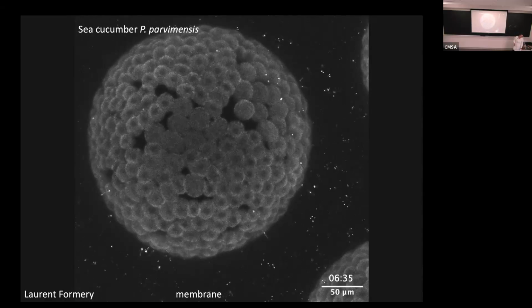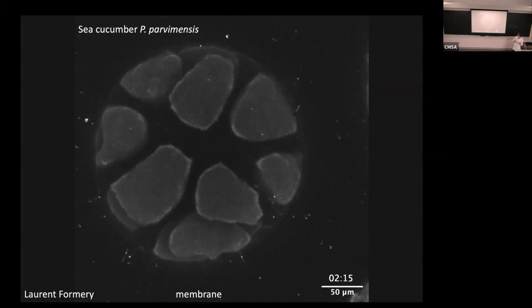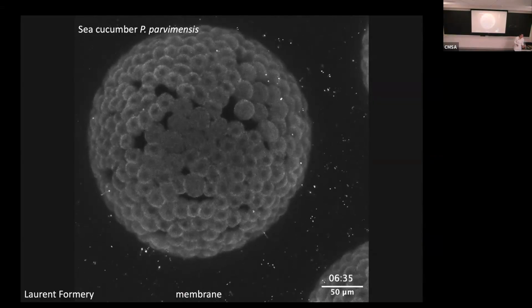Just by looking at it, you can see this is the same embryo, the same species, and you see how this envelope is very different. I think there is more extracellular matrix-like material in the interstitial fluid, and the cells are spreading onto it because they're not just floating into nothingness like some of the sister species. I'm going to play this once more because it's very pretty. I think what you're seeing is that as the cell cycle progresses, they round up for cell division, and then when they relax, they make these protrusions into the matrix.